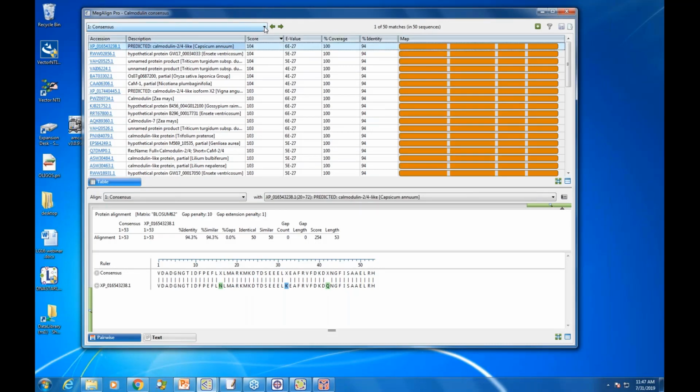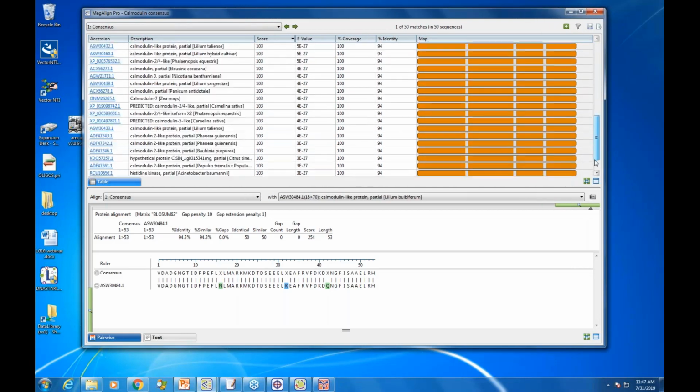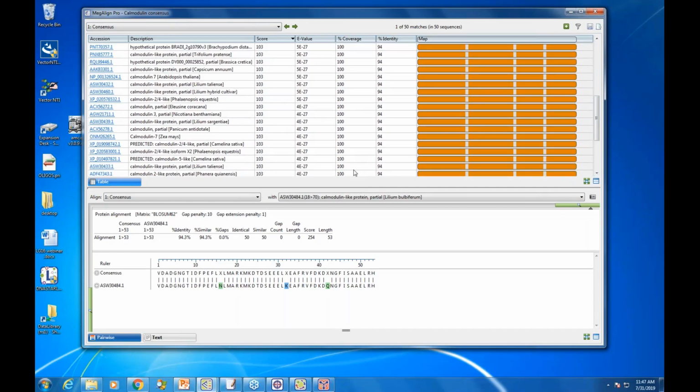There's a pull down at the top that, if you have a multi-sequence query, you can use to select the query sequence. Then you go through, and you'll see that we have a pairwise alignment below. I can use my arrow key and quickly go through these results, and we get e-values and scores, and a little map that shows us how similar they are, so it's styled more similar to NCBI. I get a text output as well.